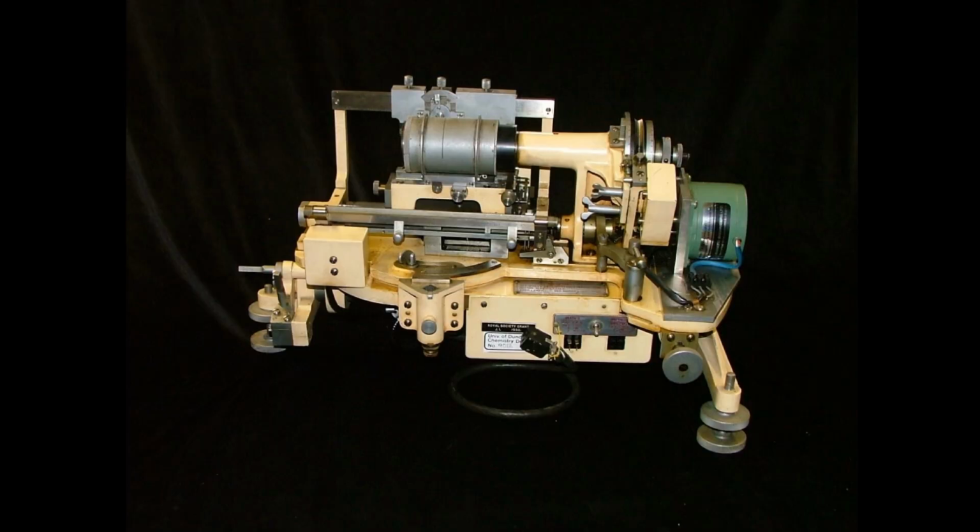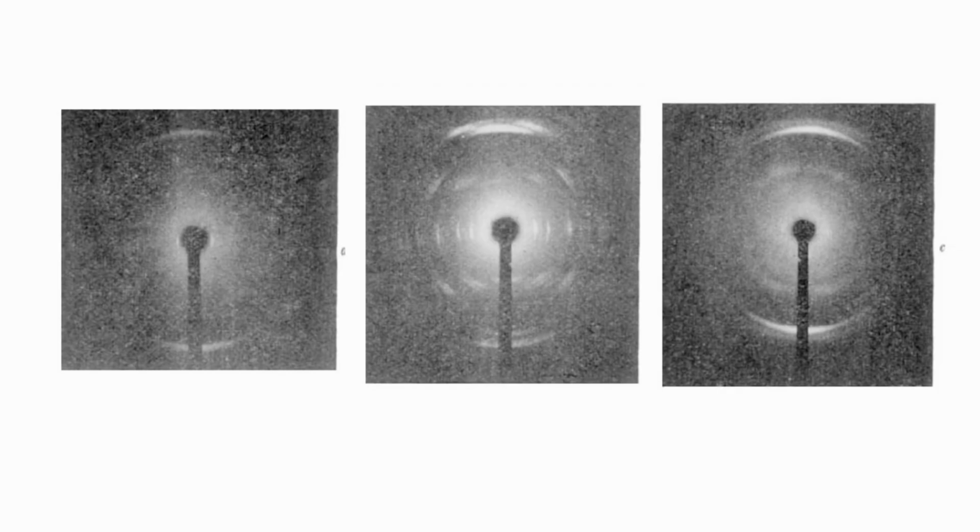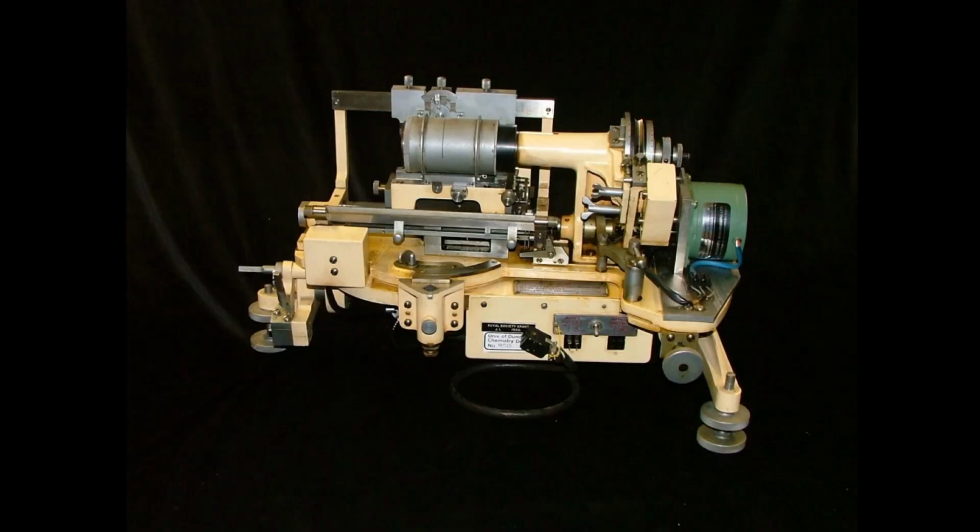This is called a Leeds Weissenberg camera, and it was a state-of-the-art piece of kit for X-ray crystallography work. It works by rotating the crystal during the photography, while also synchronising the movement of the film, and it does this again and again until you can get a suitable intensity of exposure. The results allow for far quicker and easier interpretation of X-ray diffraction patterns, and this camera was of such high quality that it actually remained in use here for almost 50 years.